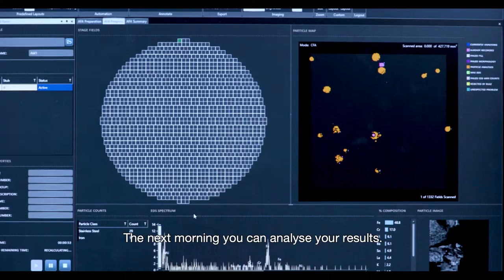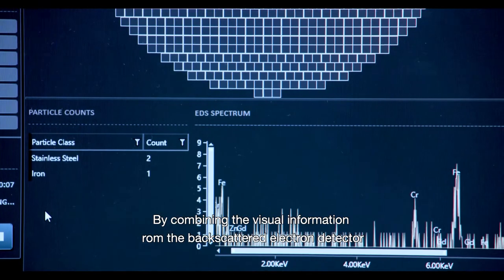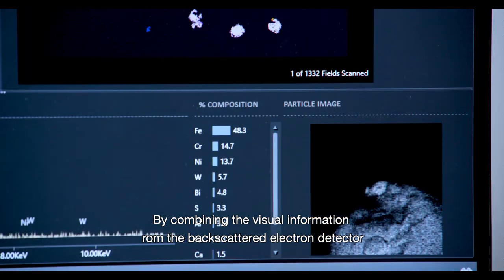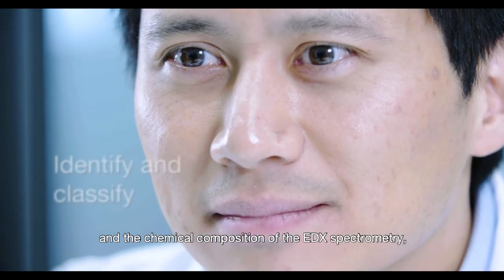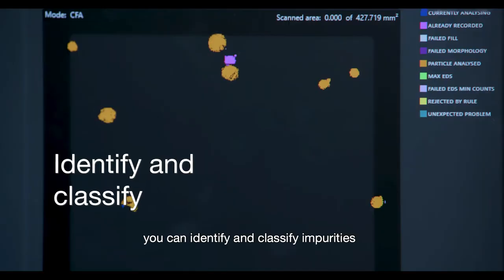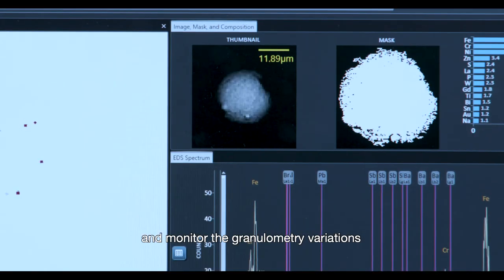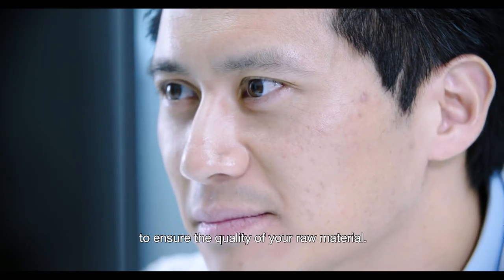The next morning, you can analyze your results. By combining the visual information from the backscattered electron detector and the chemical composition from EDX spectrometry, you can identify and classify impurities and monitor granulometry variations to ensure the quality of your raw material.